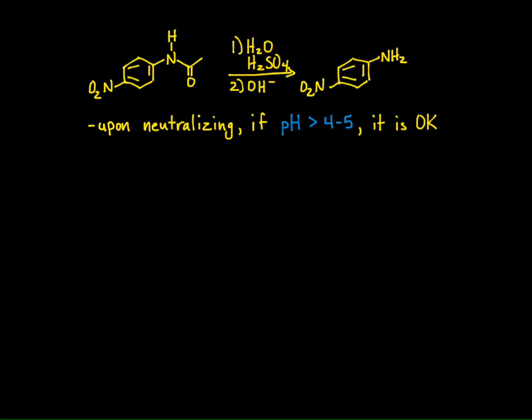Once the reflux time is complete and the reaction has cooled to room temperature, you will neutralize the anilinium salt to a pH of 4 to 5. Remember, this is a titration. You are neutralizing all of the residual sulfuric acid and then the anilinium salt. You won't see a big change initially, but you need to add the sodium hydroxide slowly because once all the sulfuric acid is consumed, then you will see a big change in pH. If the pH goes over 5, don't be alarmed again as long as you have added the sodium hydroxide slowly. This means you have a slight excess of base, which will be washed away.